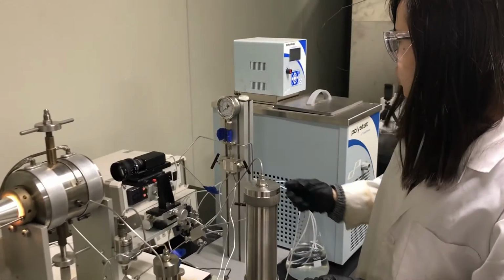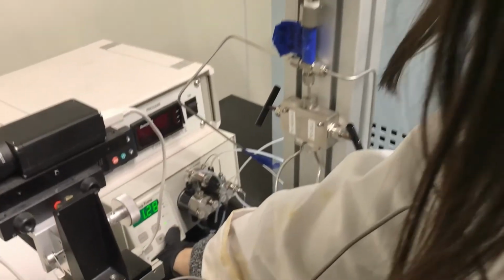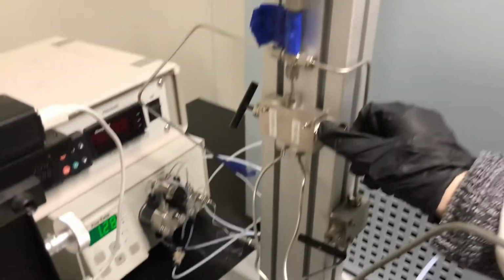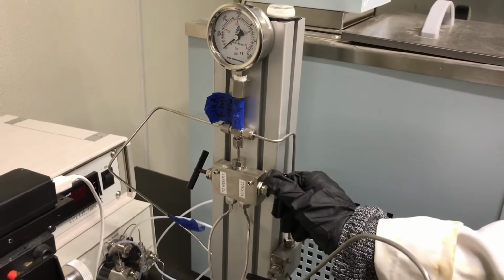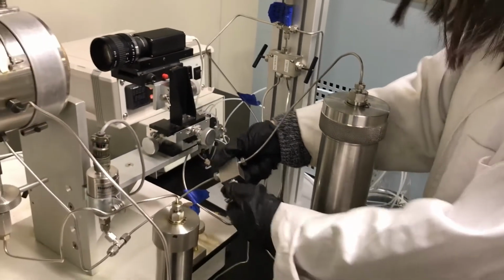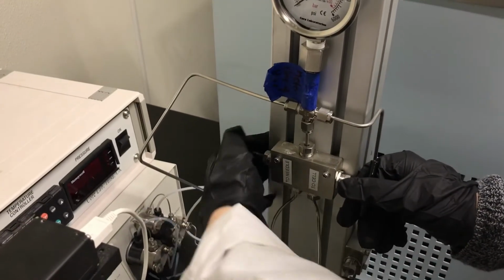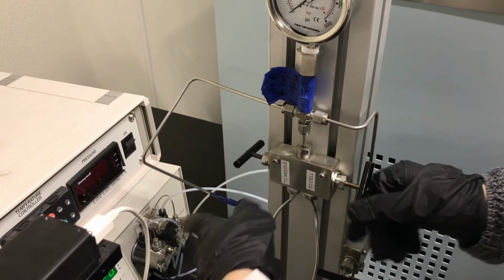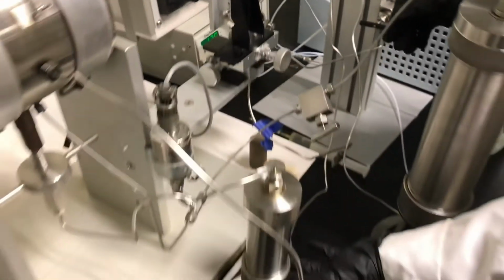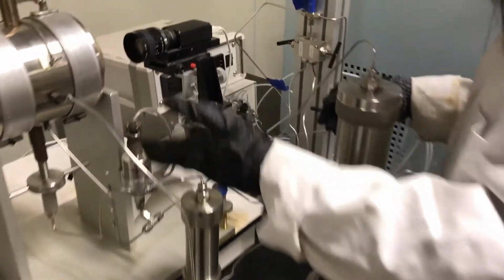And what we need to do here is stop the pump and then close this valve here, and also this one. And what we need to do is to open this valve. Then the water from the pump can be injected into this accumulator to push the oil phase inside the sample.